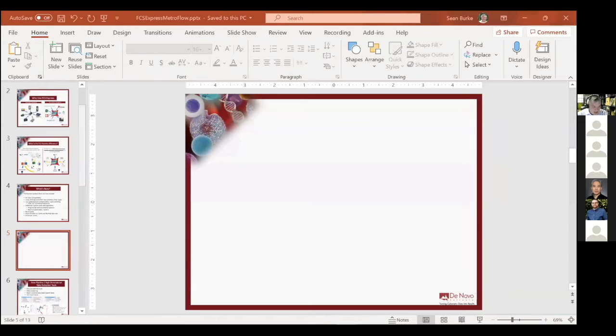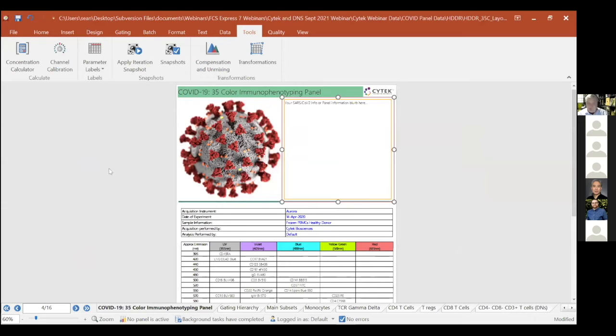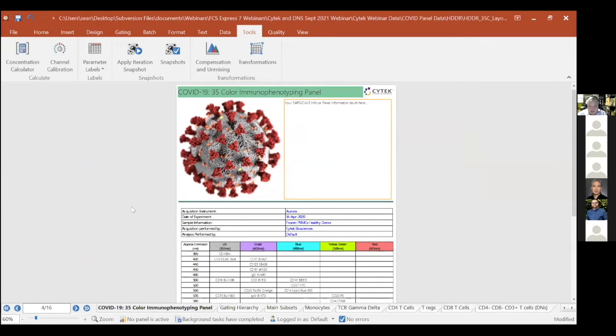Now, the last thing I wanted to show real quick, and I'll spend the bulk of my 15 minutes so to say on discussing some of the higher dimensional data reduction tools. As you heard earlier, there's this need for working with processive types of algorithms versus interactive. And FCS Express has had these tools for a very long time. This isn't something that's new to us.